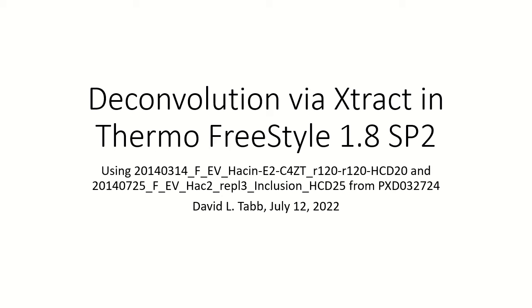So today I'd like to show you the Thermo FreeStyle 1.8 software. It comes along with XCalibur 4.5, at least FreeStyle 1.8 does, and then we've upgraded the FreeStyle software itself to SP2. Both of these are available from Thermo FlexNet.